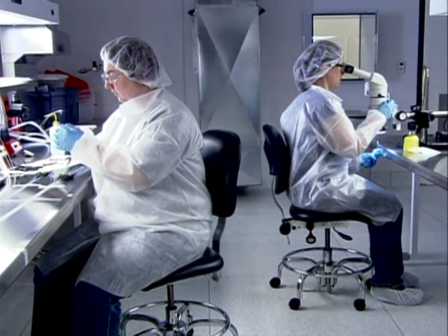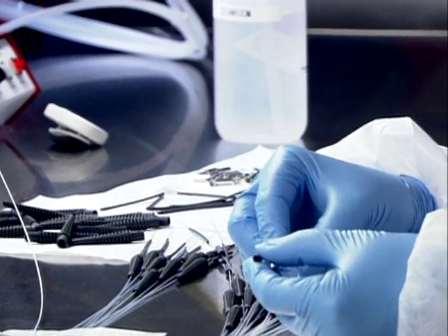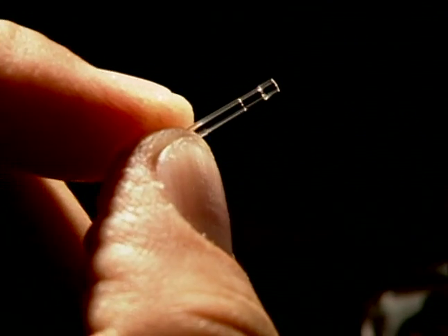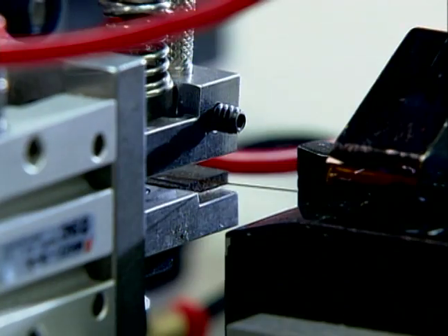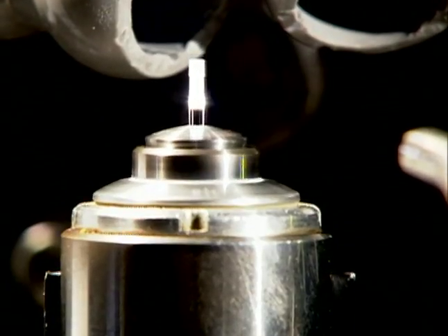Medical sub-components requiring assembly in a controlled environment are fabricated in a low bio-burden facility. End finishes for fibers or capillaries may require high precision profiles and are created through a variety of cleaving, mechanical polishing, and laser polishing processes.